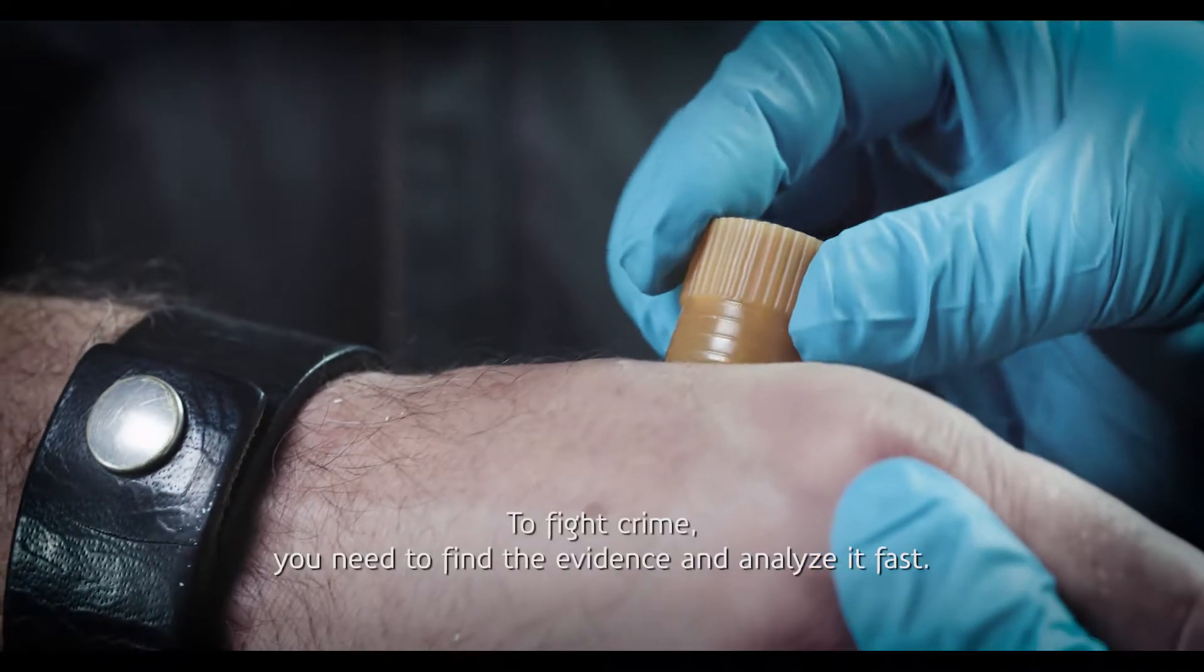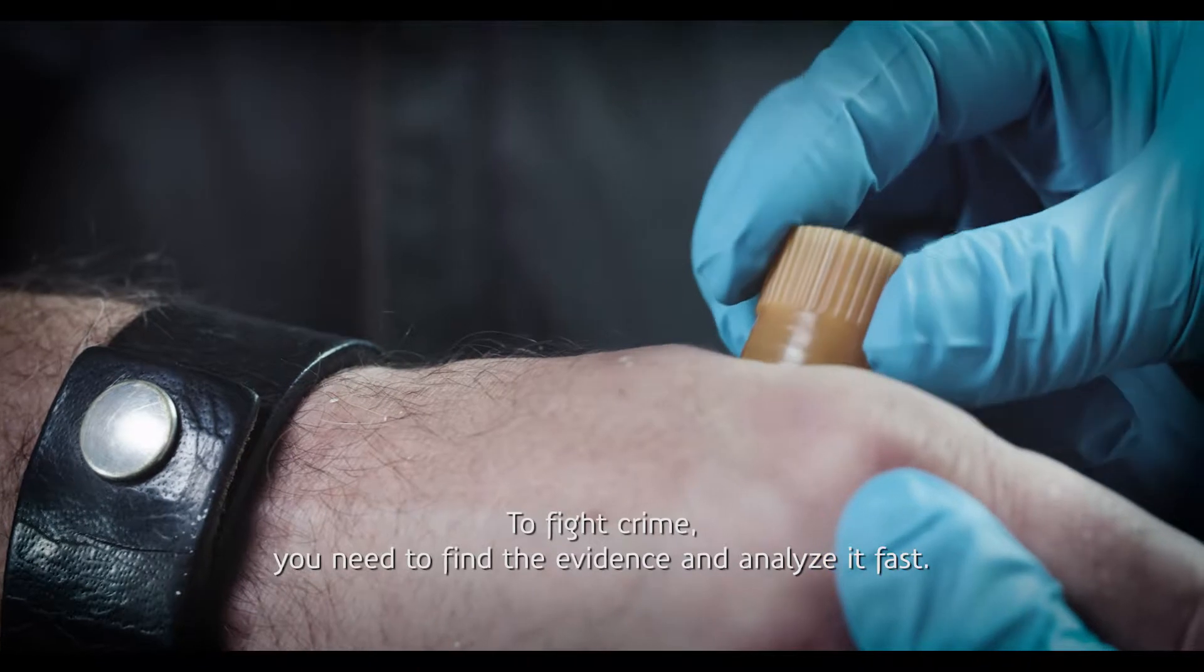Gunshot Residue. To fight crime, you need to find the evidence and analyze it fast.